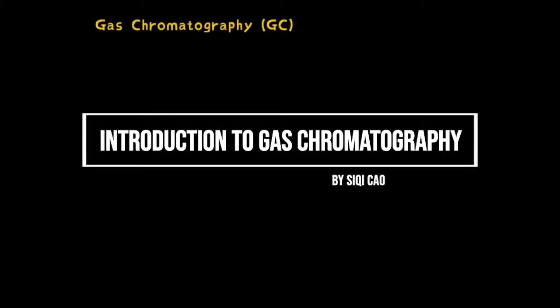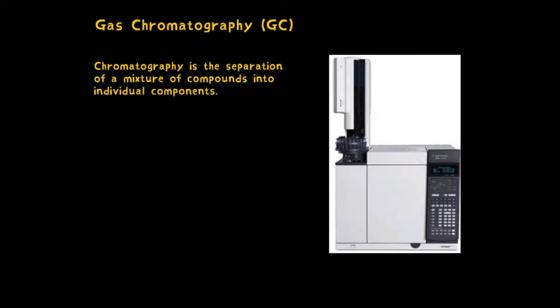Today, I'd like to introduce gas chromatography, also known as GC. The picture on the right shows the Agilent 7890B GC system. We use this GC system in our lab to analyze environmental organic compounds. Gas chromatography is the separation of a mixture of compounds into individual components.